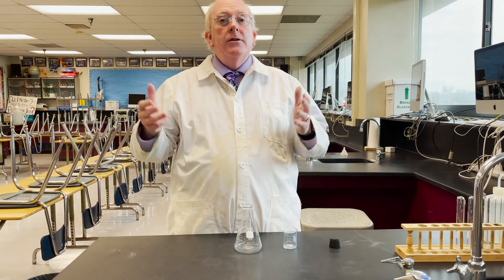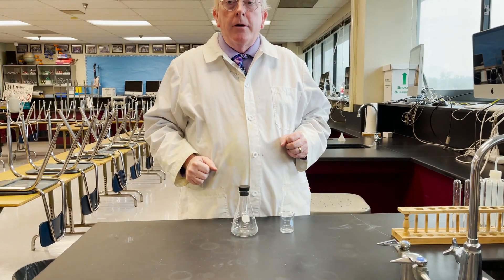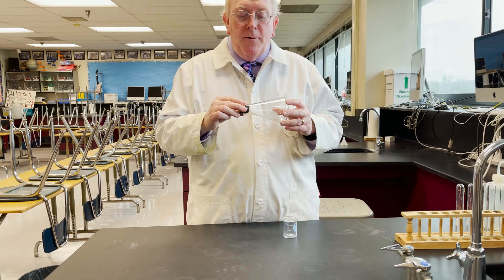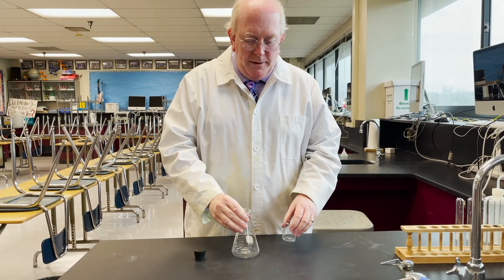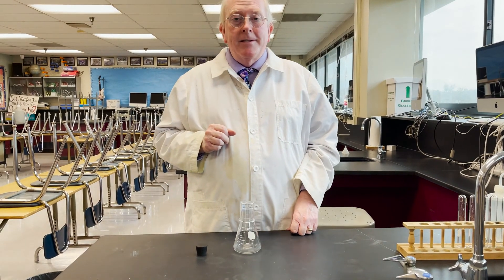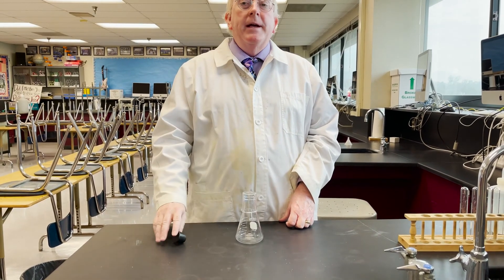We do occasionally store liquids in an Erlenmeyer flask. You can put a rubber stopper in the top, except for liquids that have high vapor pressures that might actually turn that into a cannon. In that case, we take a small beaker and put it on top so that if gas pressure builds up inside, it just comes over the top and works its way downwards.